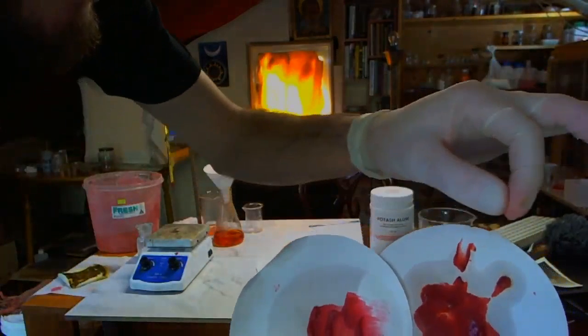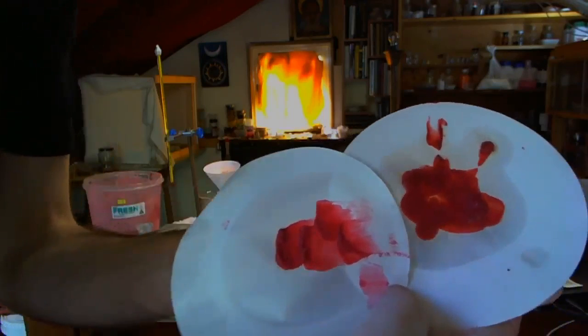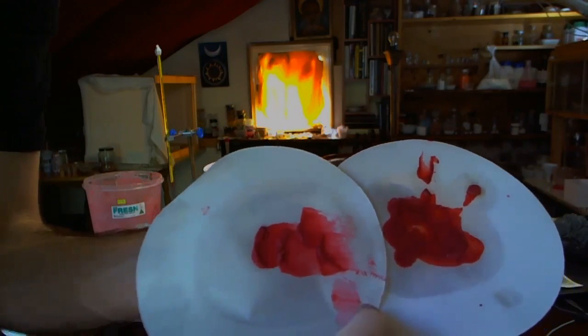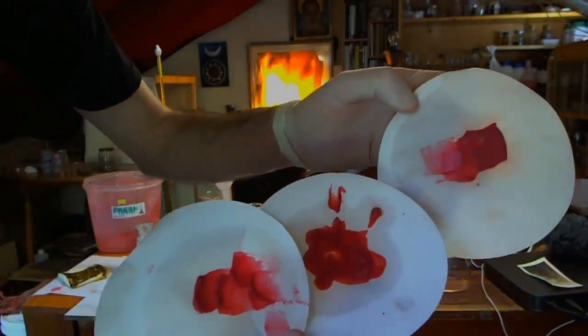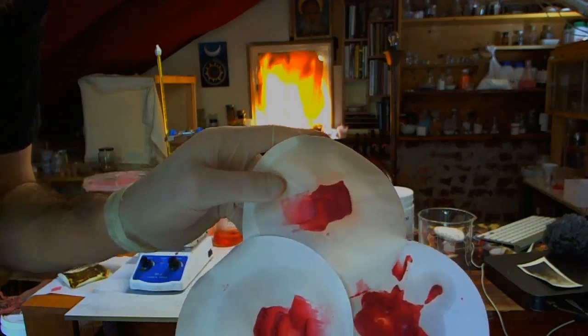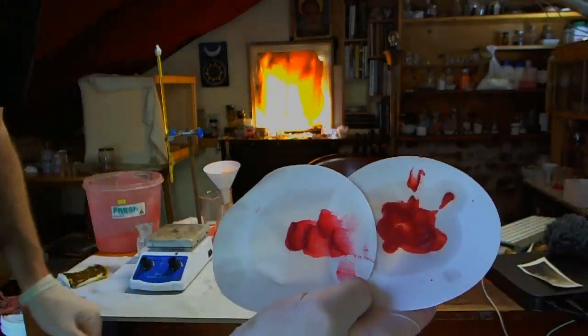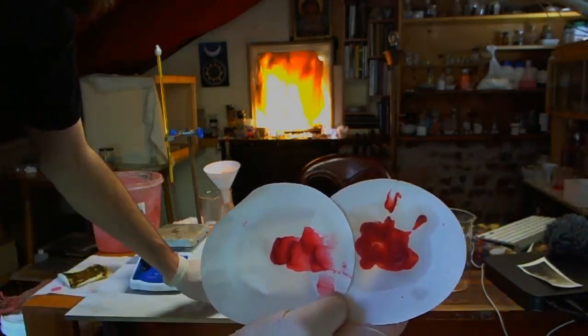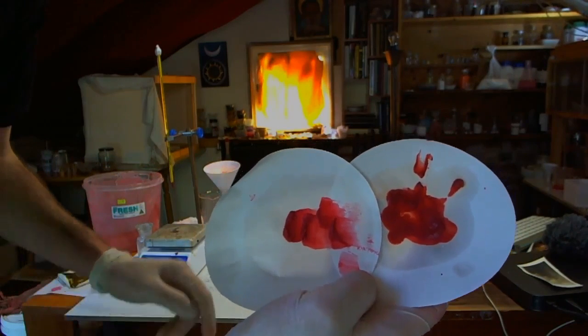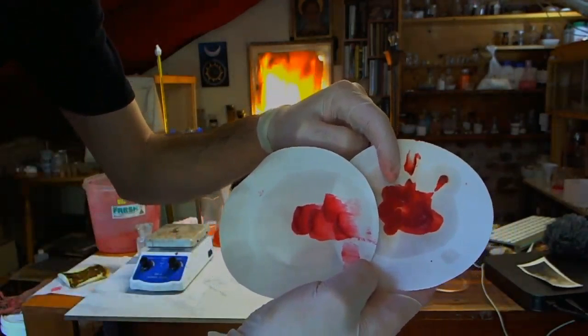It still has tiny off tones of slight brownness and stuff, which I think are very, very difficult to see on camera. It's definitely better than the hydrochloric acid wash. I think we can disregard that method and it's not necessarily working very well. So this was just the 1% sulfuric acid soak.